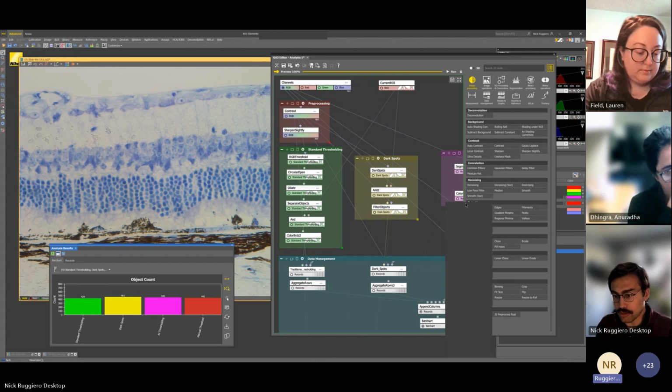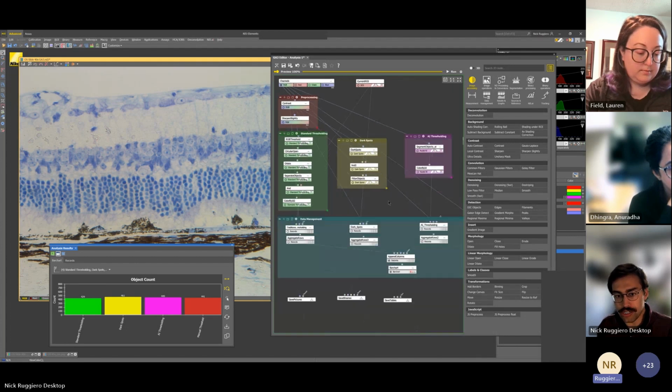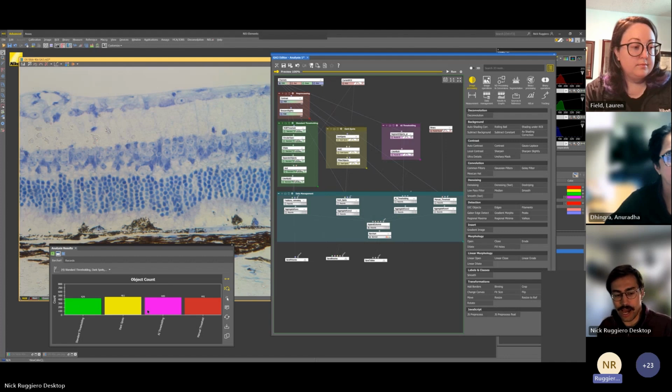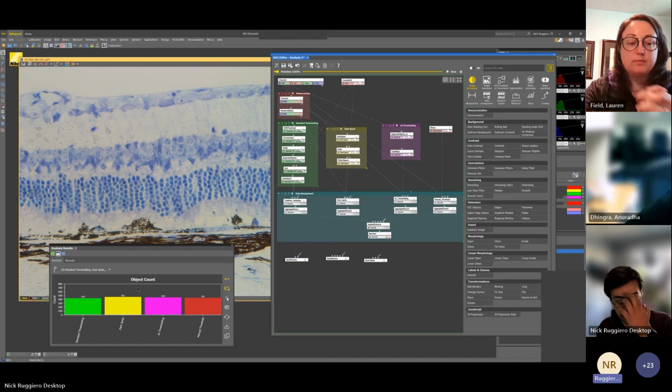This image is going to be a little bit different because I wanted to show that there are maybe some different ways to get very similar results, different things we can do, as well as how to do some data management for one of the first things. So this object count bar chart here, I'll mention it, and then we'll get into what it's actually doing right after this.